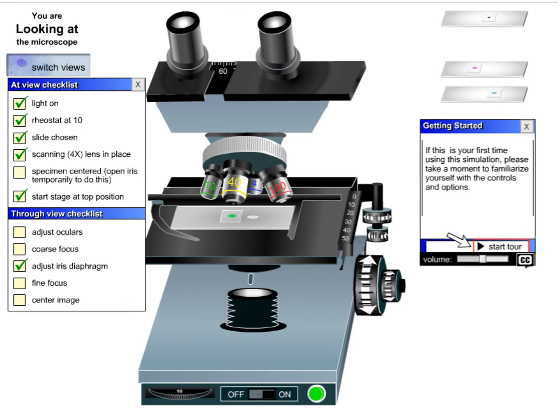When you click on the link that is in the PPT, put it into your web browser, you are going to be brought to a page that looks basically just like this. You'll hear kind of a robot voice talking you through a brief introduction. If you'd like, you can take this tour and it'll explain to you how to do these things. If you're kind of good at problem-solving websites, then you can probably just get started right away. Look at all the things that there are available. You can click on pretty much everything that there is here. Over here on the right, that is where there are four different slides to choose from. You're going to need the two slides I listed already, so you'll need to get those from there.